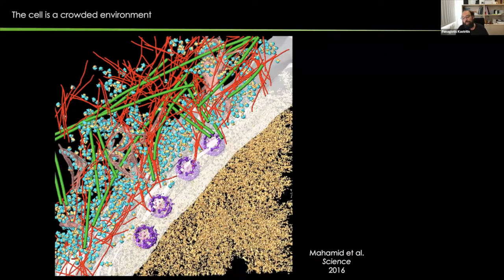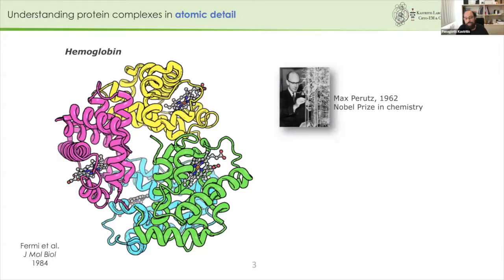So we have reached, during these last 5 years, a state where we can directly look at a cell with cryo-electron microscopy and see the most abundant species directly in the cell. But as you can see here, there are 5, 6 of these biomacromolecules modeled. And we all know that the cell is composed of many, many more. And that's why, as structural biologists, we want to understand these in atomic detail. And we are on the other edge of what this tomogram shows.